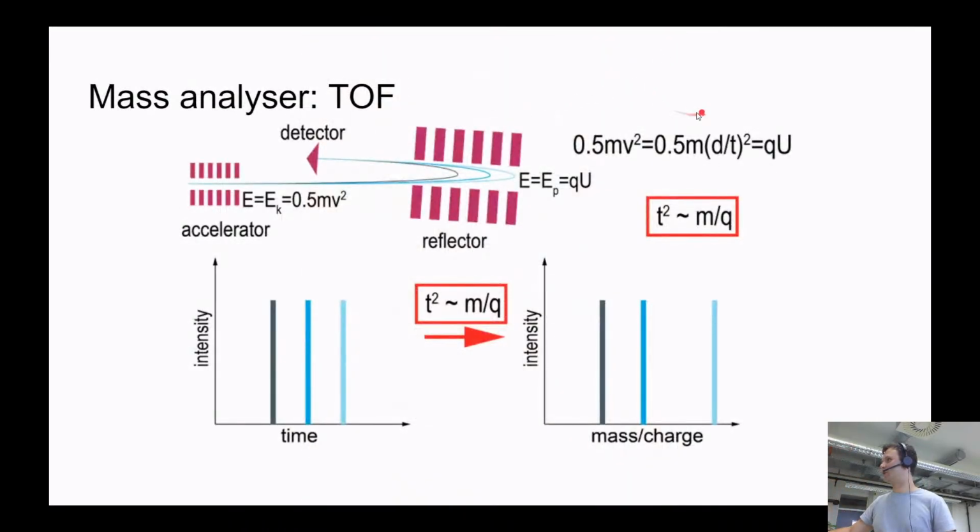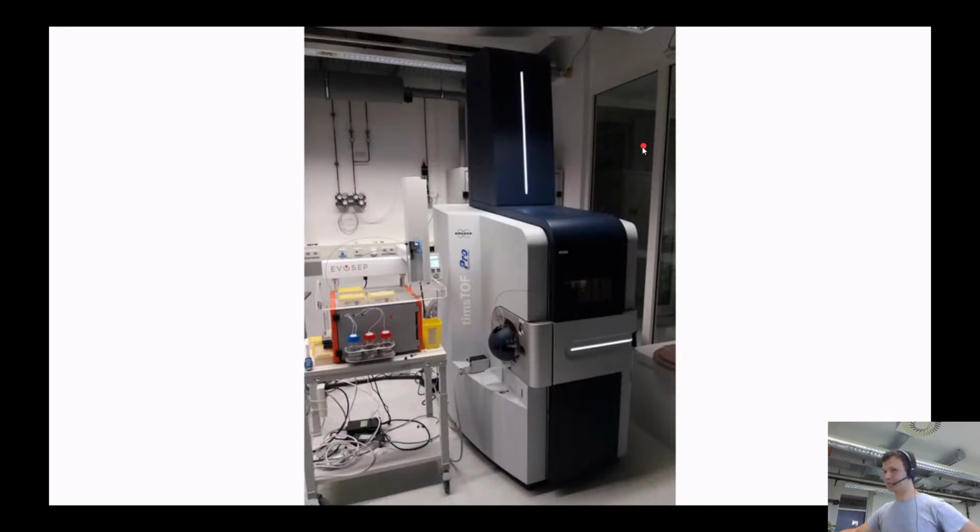As a result, the distance which a molecule flies is a bit higher. So all molecules travel longer. As a result, from the perspective of the detector, all molecules start getting a bit heavier. This is actually the correct answer. Okay, cool.